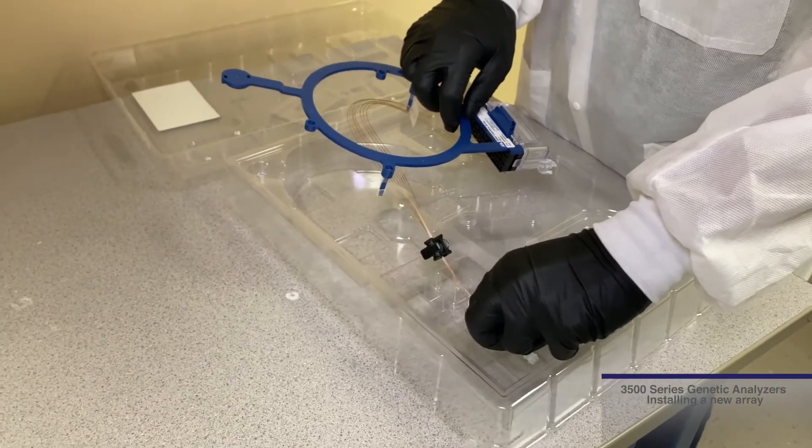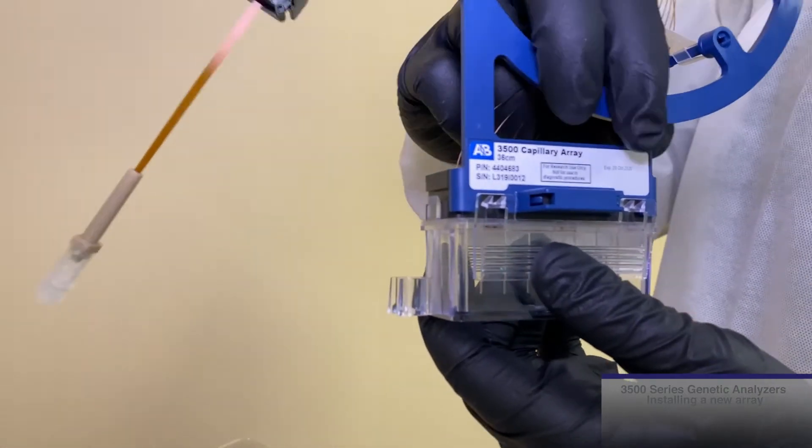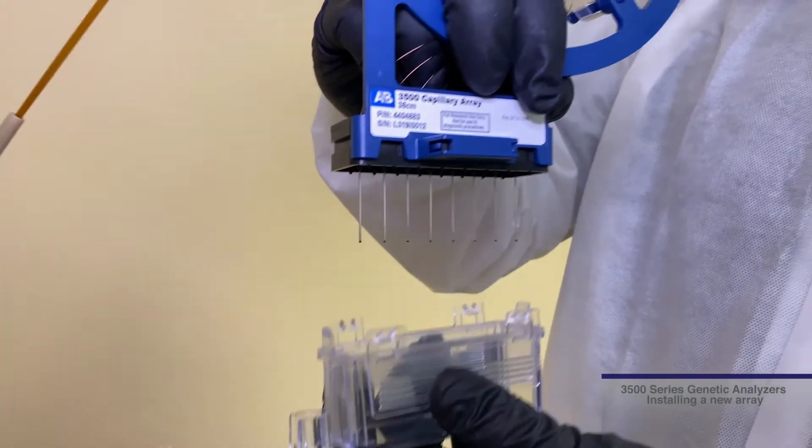Remove the new capillary array from the packaging. Using two fingers, press down on the plastic clips to remove the electrode cover from the header of the array.